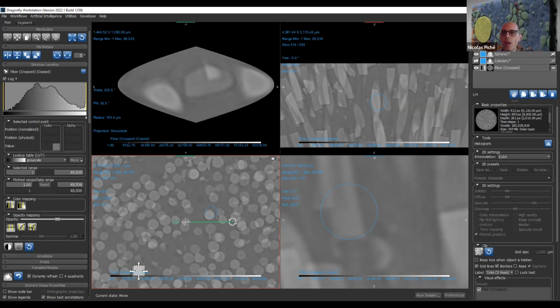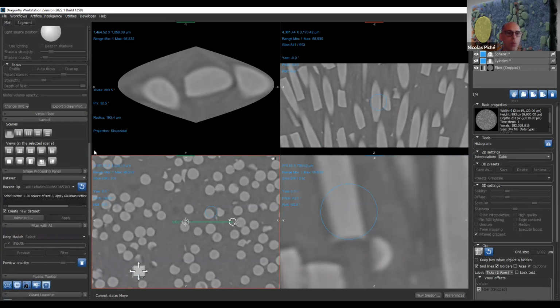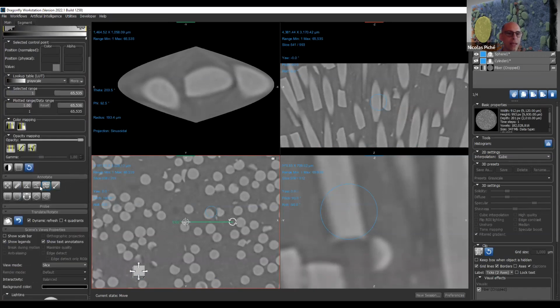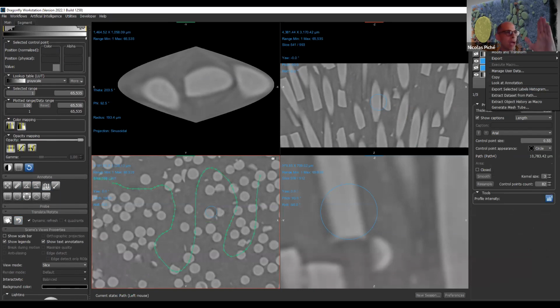It's not on view, in fact, not a view like that. I'm supposed to work on exactly what you're asking for, but for now, what people could do is take an annotation and, like I did earlier, trace the contour of whatever and ask for a channel unwrap of that on an oblique, on the normal, on the perpendicular of the path.